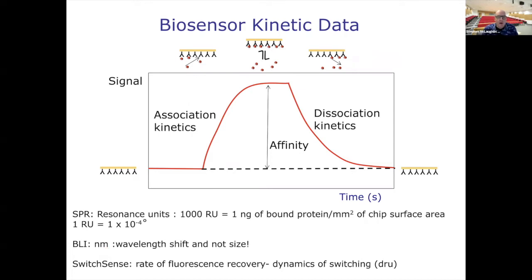With switchSENSE, we're looking at the nanolever dynamics, and we'll look at the rate of fluorescence recovery and the dynamics of switching, so it's called the dynamic switching units.